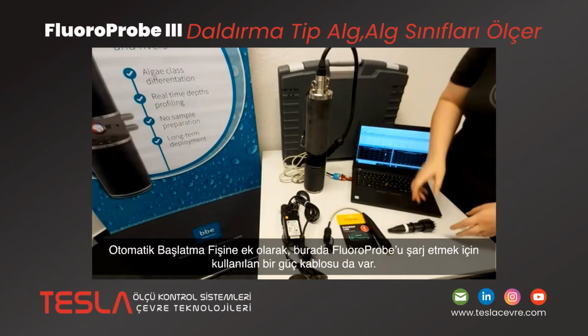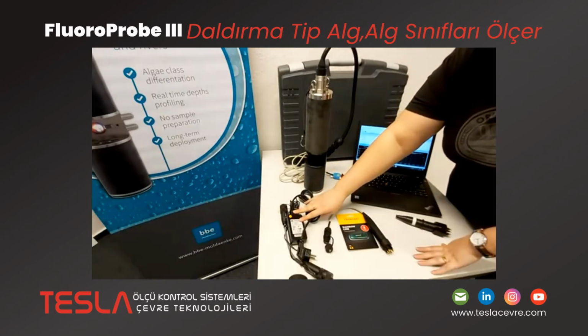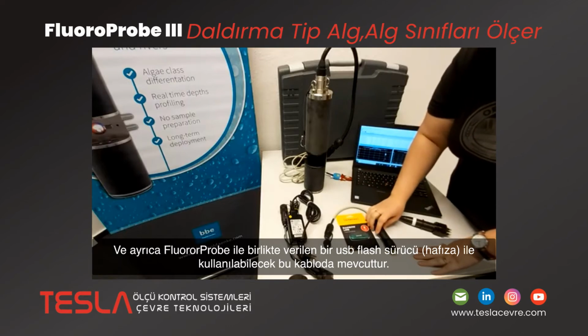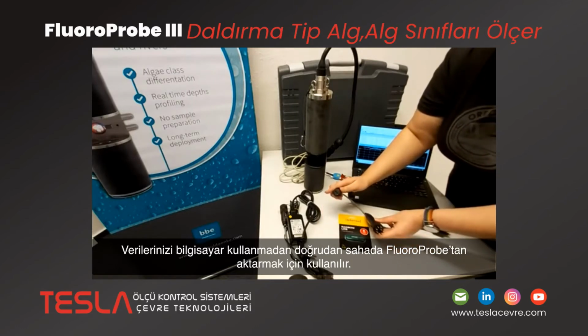In addition to the auto start plug, there's also a power cable here, which is used to charge the FluoroProbe. And then we also have this cable here, which can be used with a USB flash drive, which is also included with the FluoroProbe, in order to download your data directly from the FluoroProbe in the field without the use of a computer.